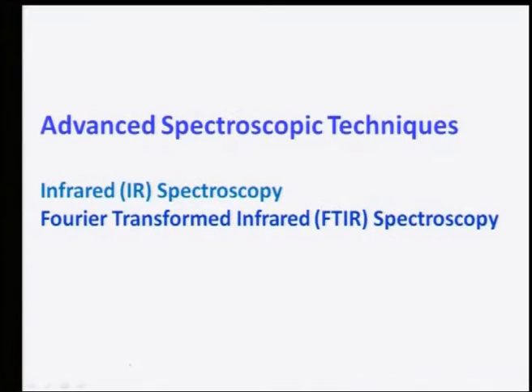So far, I have discussed infrared spectroscopy as a part of the different techniques for advanced spectroscopic analysis. So now I am going to move on to Fourier transform infrared spectroscopy. Well, Fourier transformation is a very generic term.